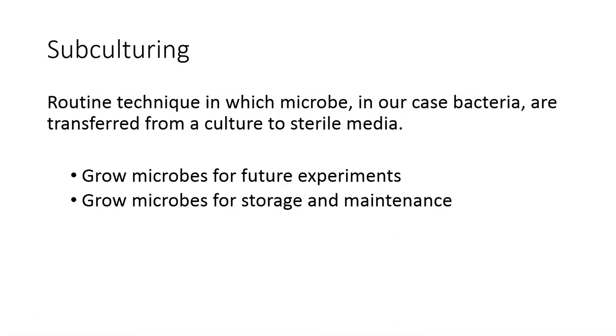Well, we need to keep microbes growing in the lab so that we can do future experiments. We might be doing this transfer in order to generate pure cultures of bacteria. Maybe we want to grow the microbes just to store them for later or to maintain the cultures. All of these are valid reasons to subculture.